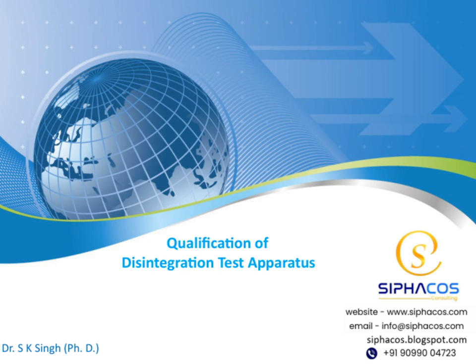Today, we will be discussing the qualification of the disintegration test apparatus. This is a key topic in ensuring the reliability of pharmaceutical testing. Over the course of this presentation, we'll cover the essential aspects of the apparatus qualification process, including the standards and procedures involved. I look forward to sharing this information with you and engaging in a productive discussion.